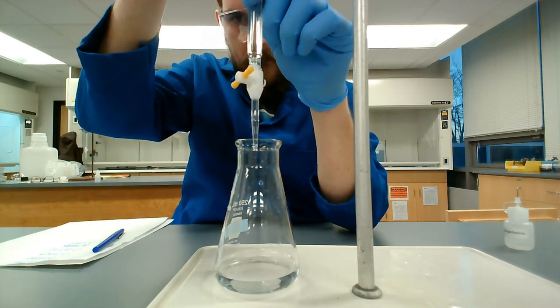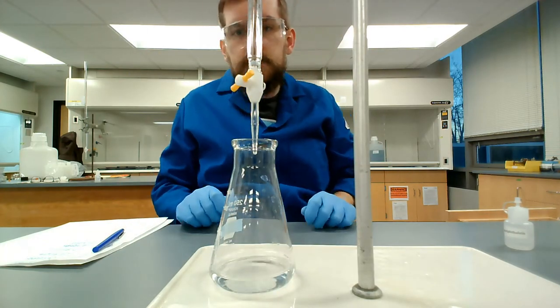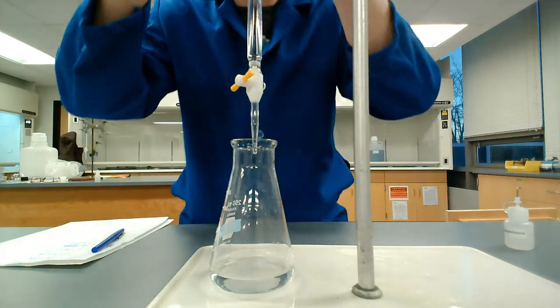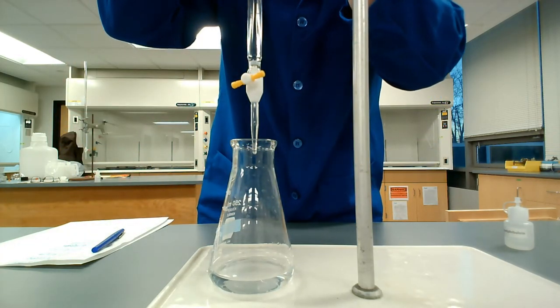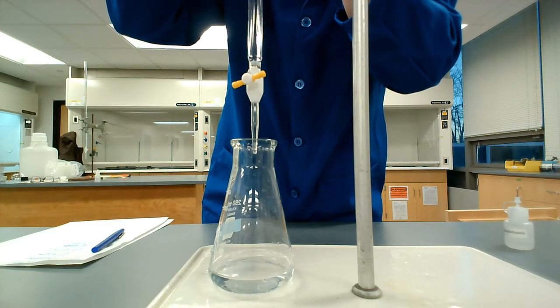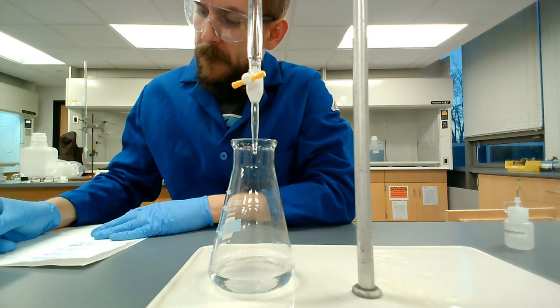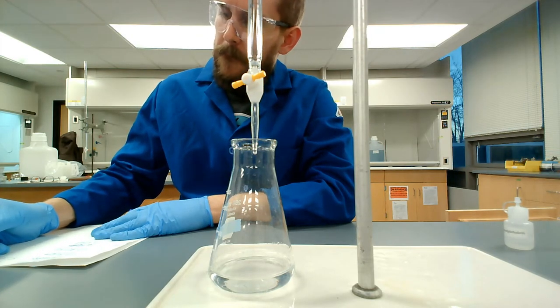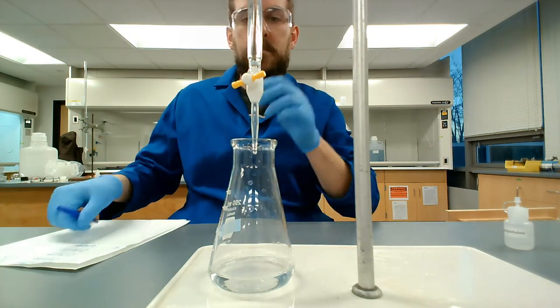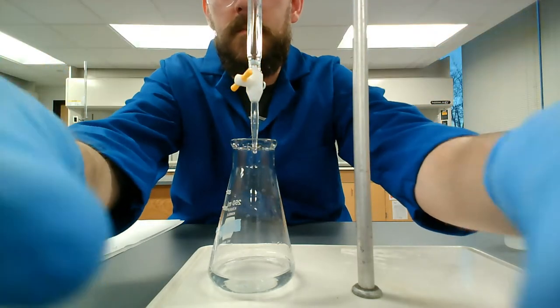Before I start this titration, I want to make sure the tip of the burette is below the rim of the Erlenmeyer flask. That prevents me from spilling on the outside, and it also prevents splashing. So I'm getting my initial burette reading here before I start. Again, a lot of prep work, making sure this burette is filled with sodium hydroxide and only sodium hydroxide.